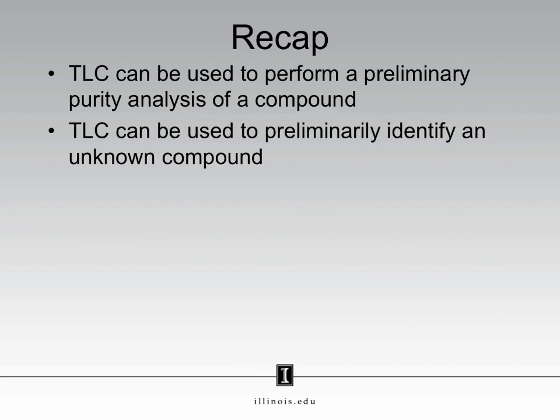TLC can be used to preliminarily identify an unknown compound. The retention factor for a compound is characteristic. Therefore, if the retention factor for an unknown compound matches the retention factor for a known compound, that is a good indication that the compounds are one and the same. Again, this is not definitive. It is possible that two compounds can be different but have the same retention factor.